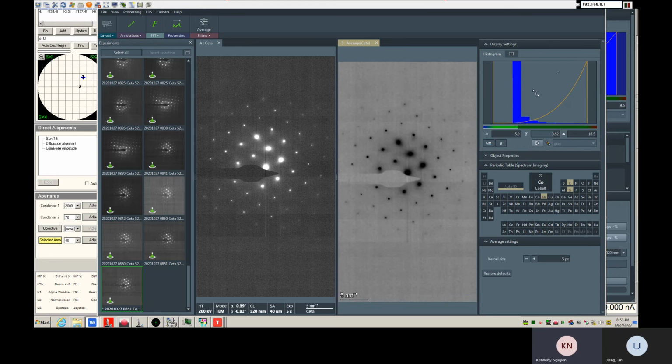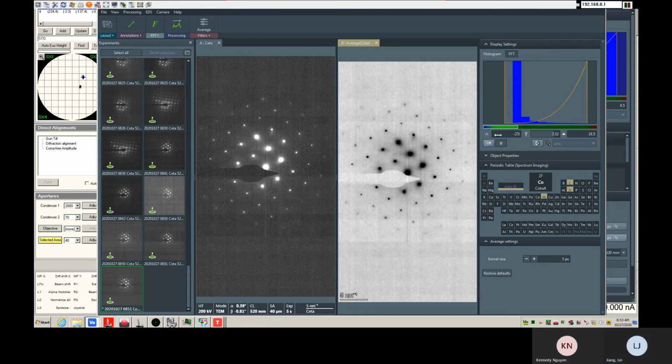Then how do you reset this line? You can reset the range by clicking this button here. And for this one, you have to either type the default value, or you can type the default value here, one.